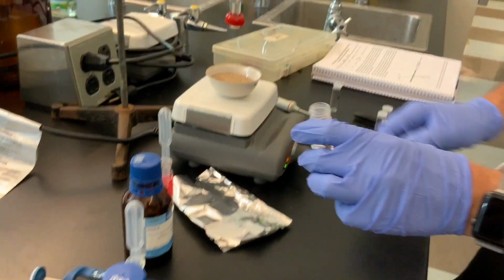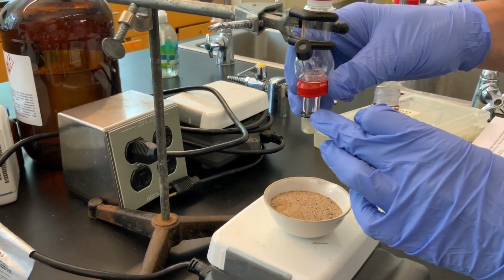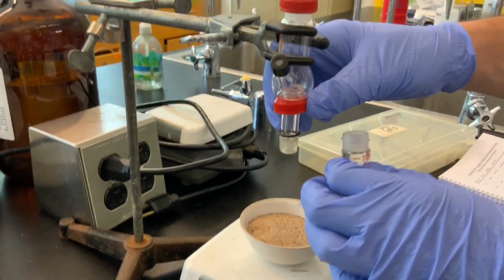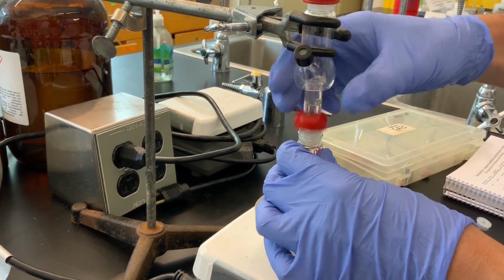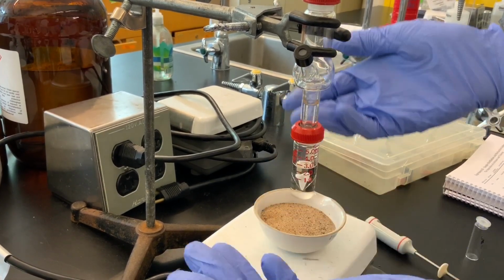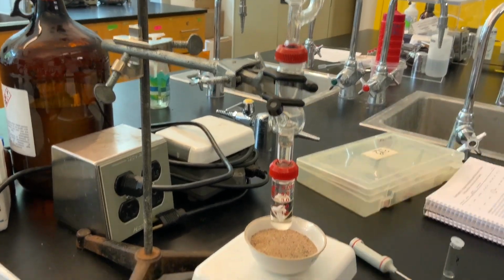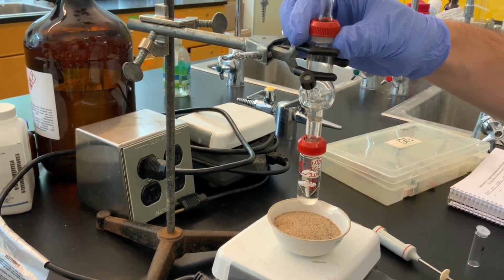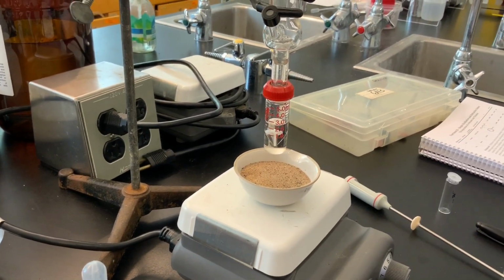So I'm going to take my reaction vial, and I want to be sure that there's this O-ring here to create a nice seal. This is the male joint of the Hickman-Hinkle still head, and now I'm going to fix it to the reaction vial, and then I'm going to use this screw cap to be sure that there's a nice seal, just like that. All right, and you can already see even from this height, as it's hovering, and I'm going to try and get it centered perfectly over the stir hot plate, the magnetic spin vane has already begun to stir.